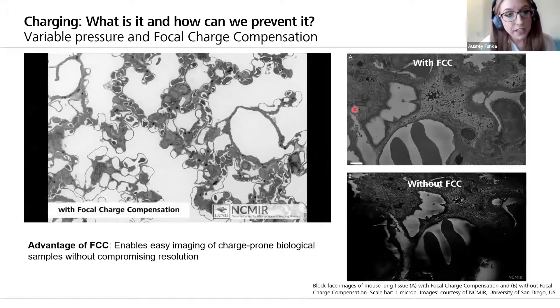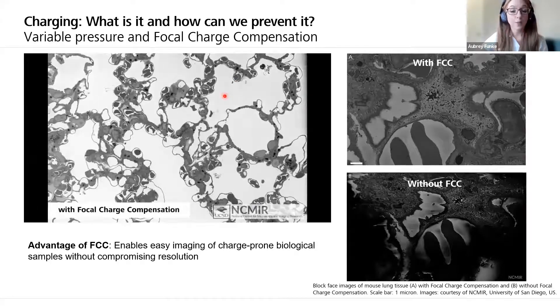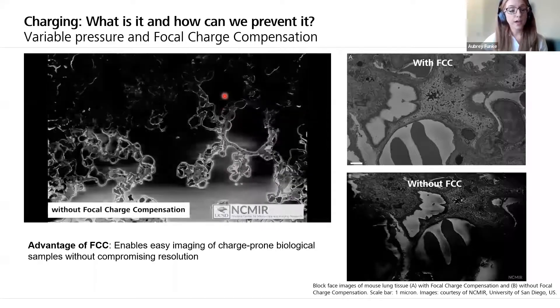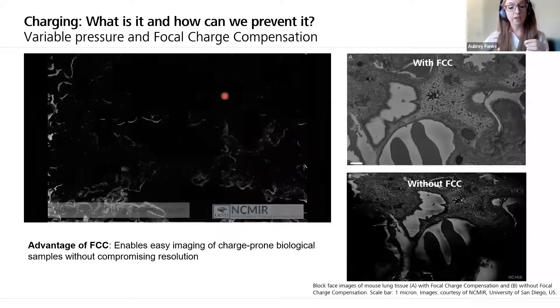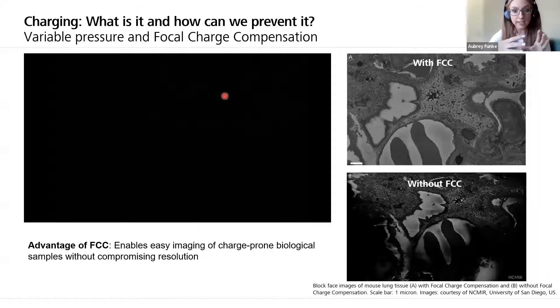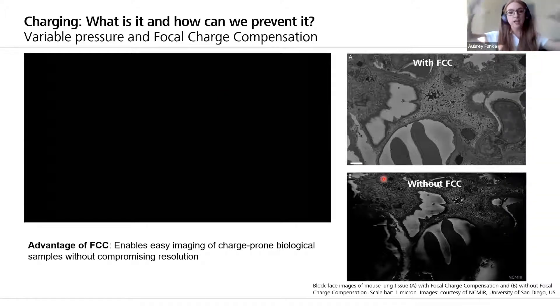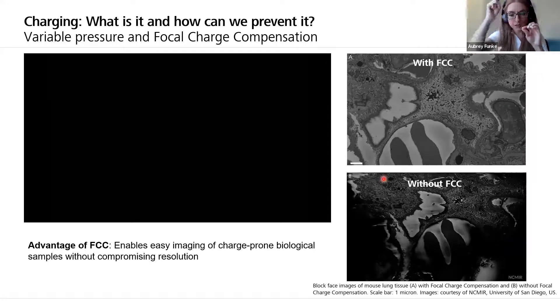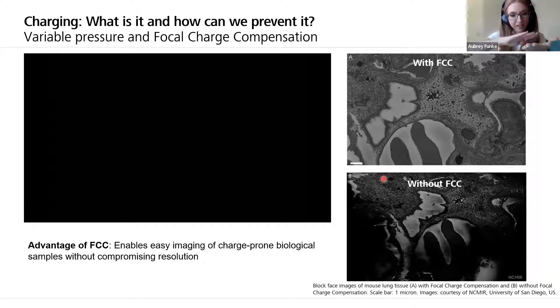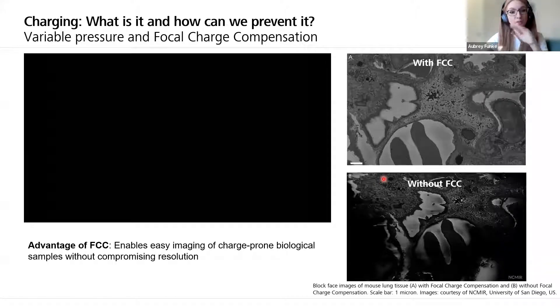Another way to address charging is focal charge compensation, or FCC. For samples like serial block face specimens with a lot of empty resin or open areas — such as in lung tissue — these are really prone to charging, specifically when they're low contrast. Similar to variable pressure but instead of affecting the entire sample chamber, it's directed just onto the sample itself. We use a little needle that directs nitrogen gas only onto the sample surface so we can cut away, get our image, cut away, get our image, with just that little bit of nitrogen right there on top to reduce that charging.